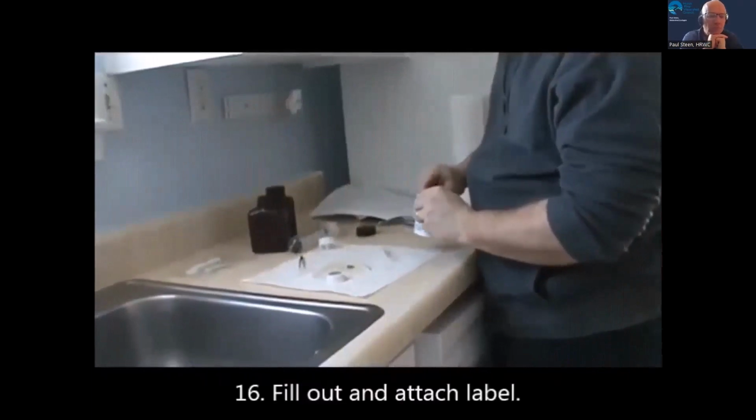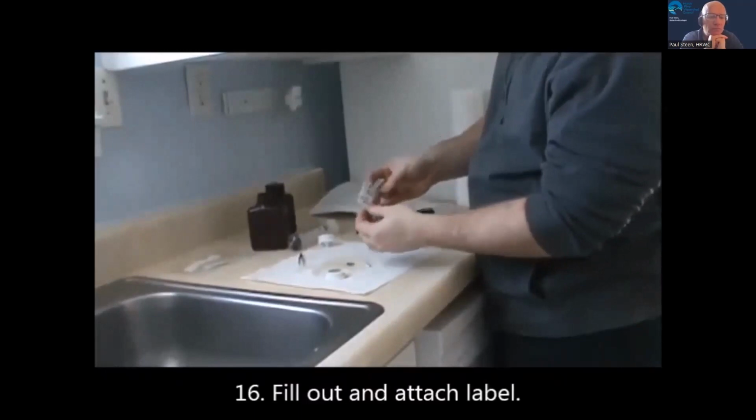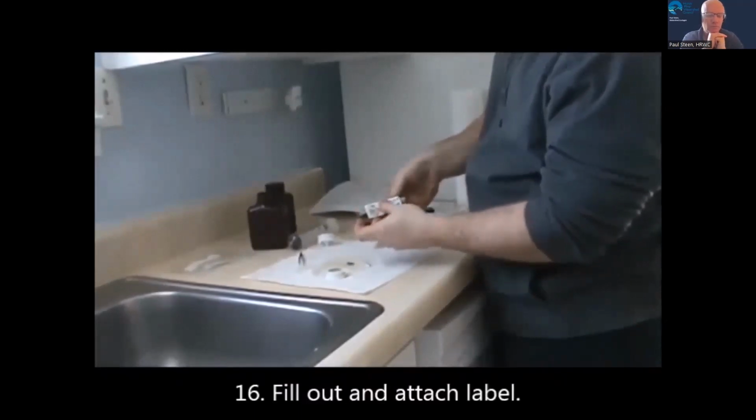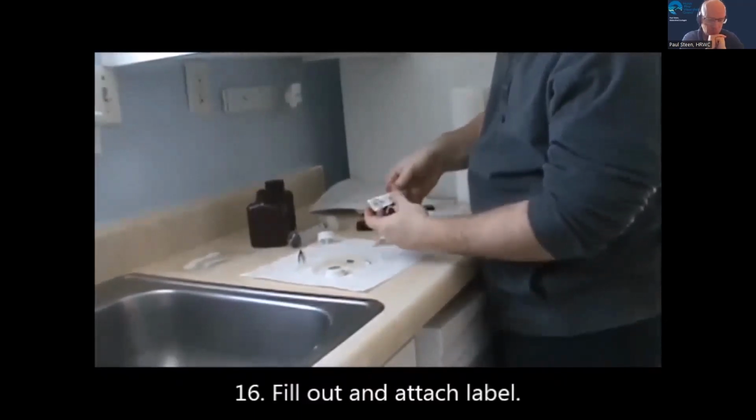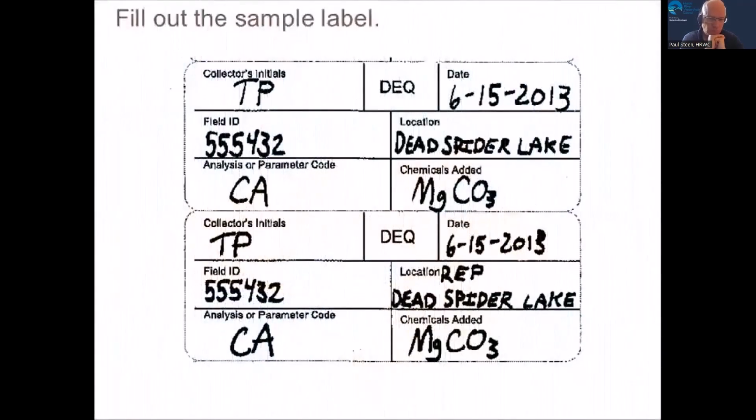Place a filled-out sample label onto the vial lengthwise so that none of the label is wrapped upon itself. Let's take a look at what a correctly filled-out sample label looks like. You need to use a fine-tipped, permanent black marker to fill out the sample labels.